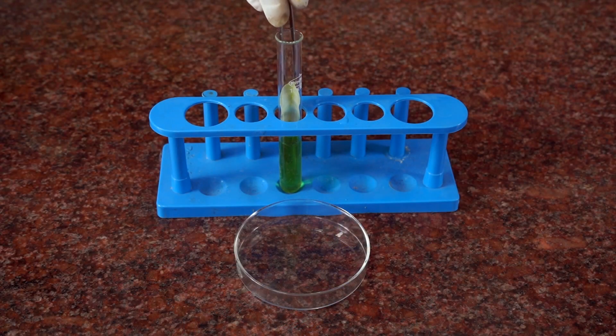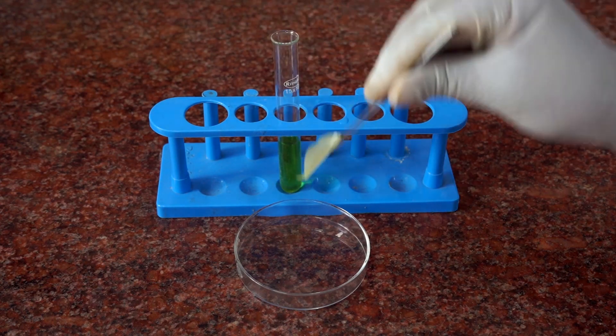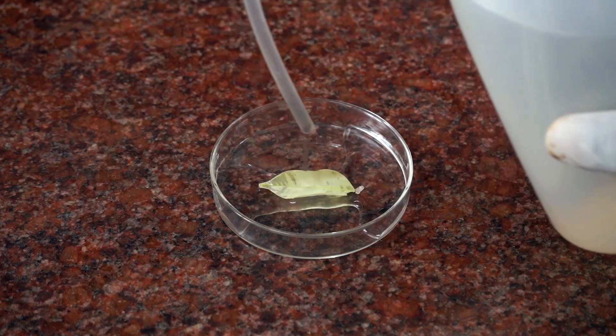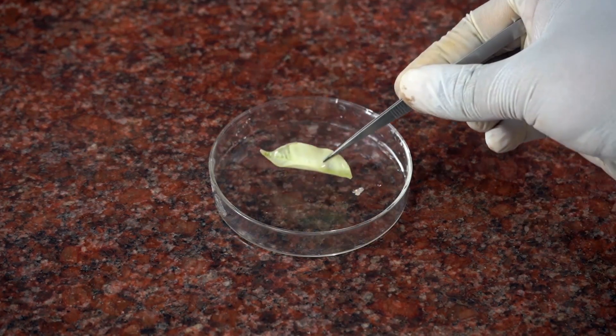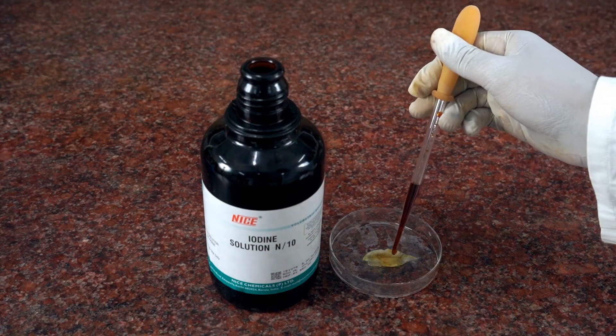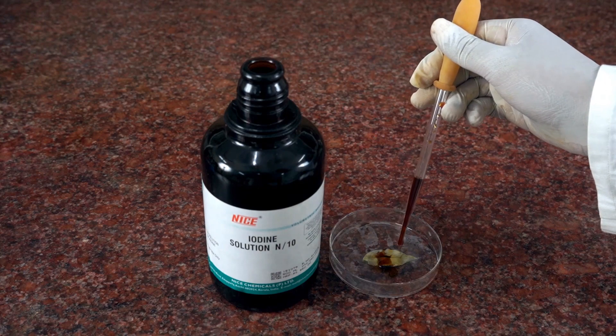Boil the water until the spirit becomes green and the leaf becomes colorless. Take the leaf from the test tube carefully and wash it with water. Place it in a petri plate and add a few drops of iodine solution.